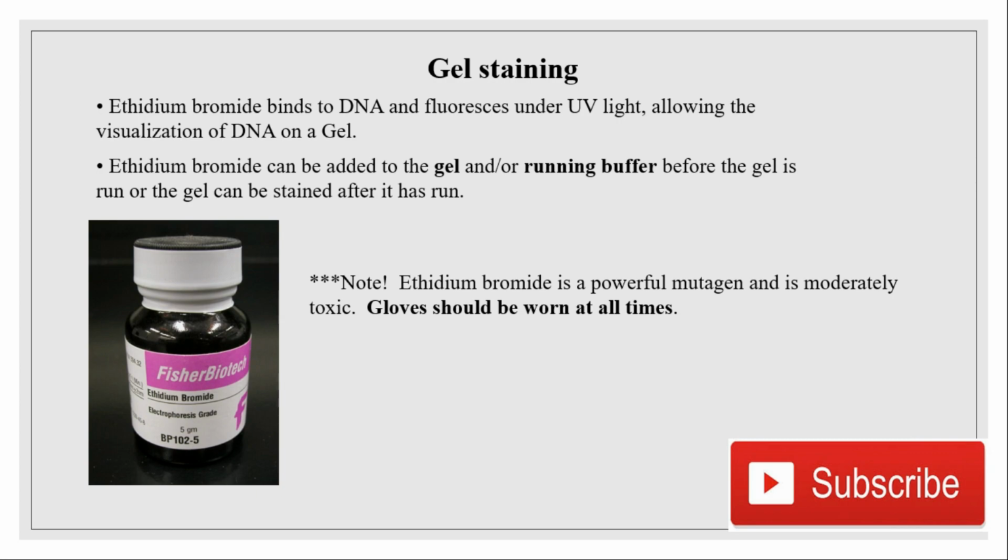So essential precautions should be adopted when we are using the ethidium bromide during the gel electrophoresis staining and during the working in the lab. So gloves and the overall that you are wearing should be compulsory, at all times when you are working in the lab.